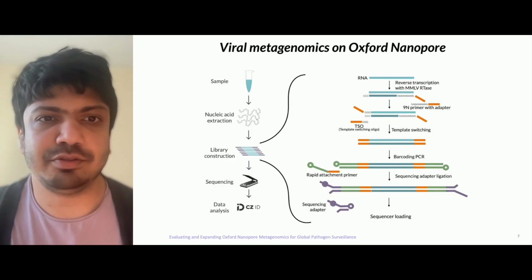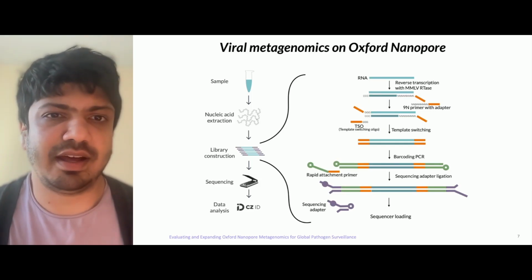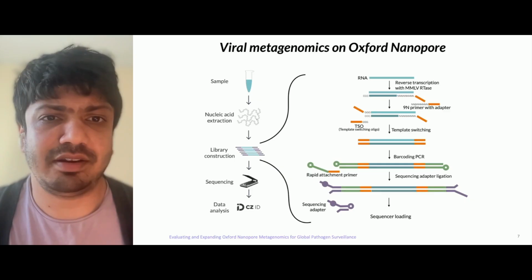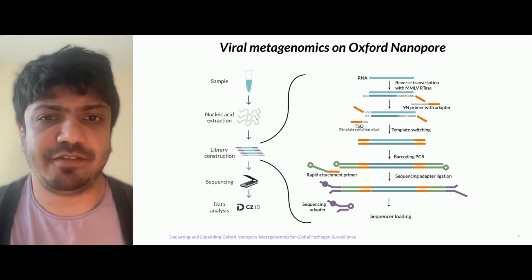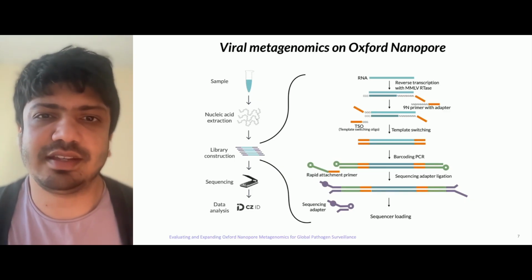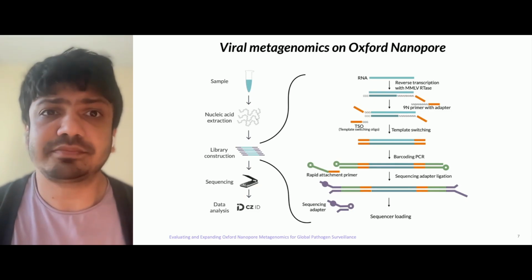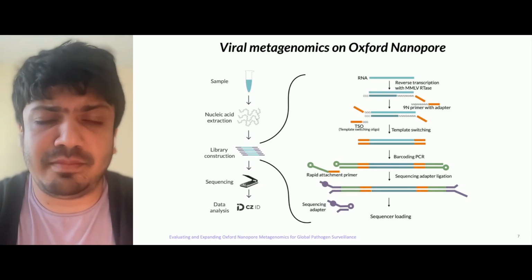In our own lab, we use Zymo extraction kits, but have also found other kits to work fairly well.